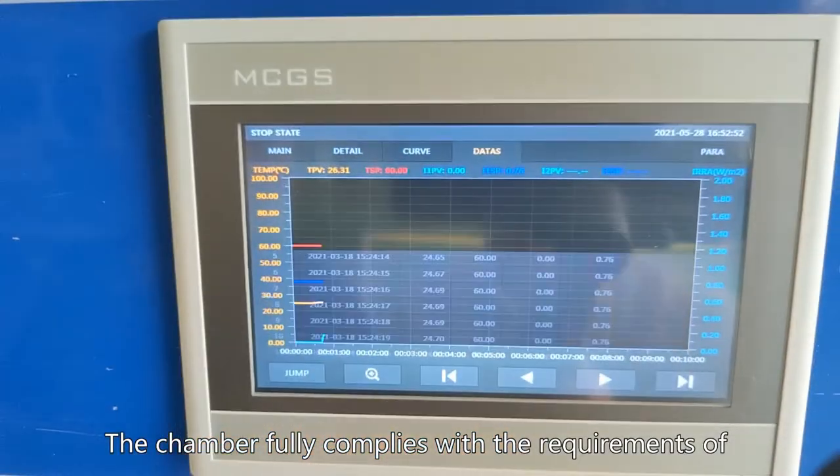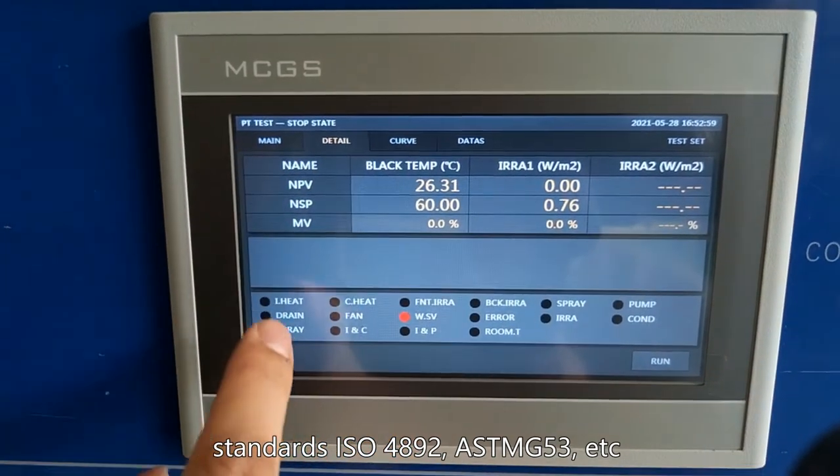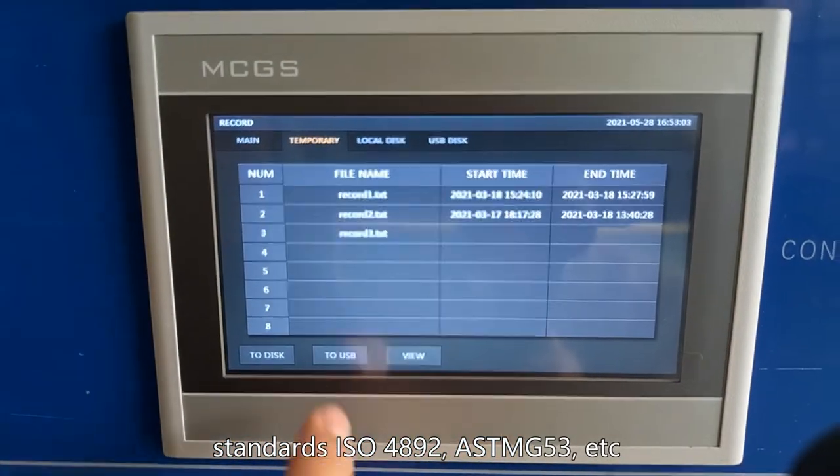The chamber fully meets the requirements of standards ISO 4892, ASTM G53, etc.